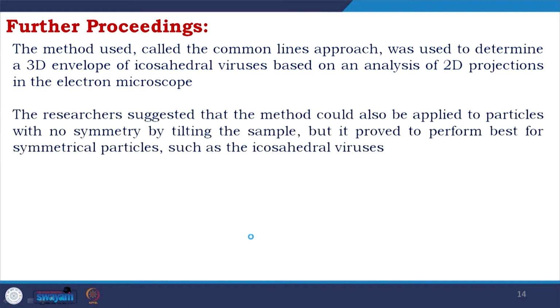The researchers suggested that the method could also be applied to particles with no symmetry by tilting the sample, but it proved to perform best for symmetrical particles such as the icosahedral virus, which maintains amazing symmetry in the structure.